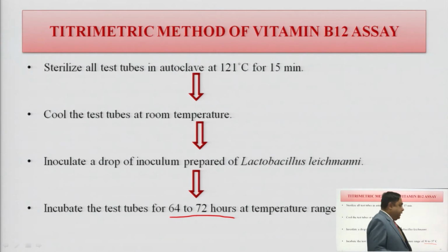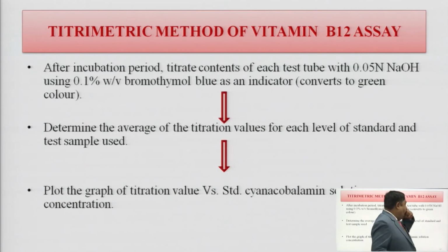Now, when they are growing, they automatically produce their metabolites, and after the incubation process is over, that is, after 72 hours, we have to titrate the content of each test tube against 0.05 normal sodium hydroxide using 0.1% weight by volume bromothymol blue as an indicator.